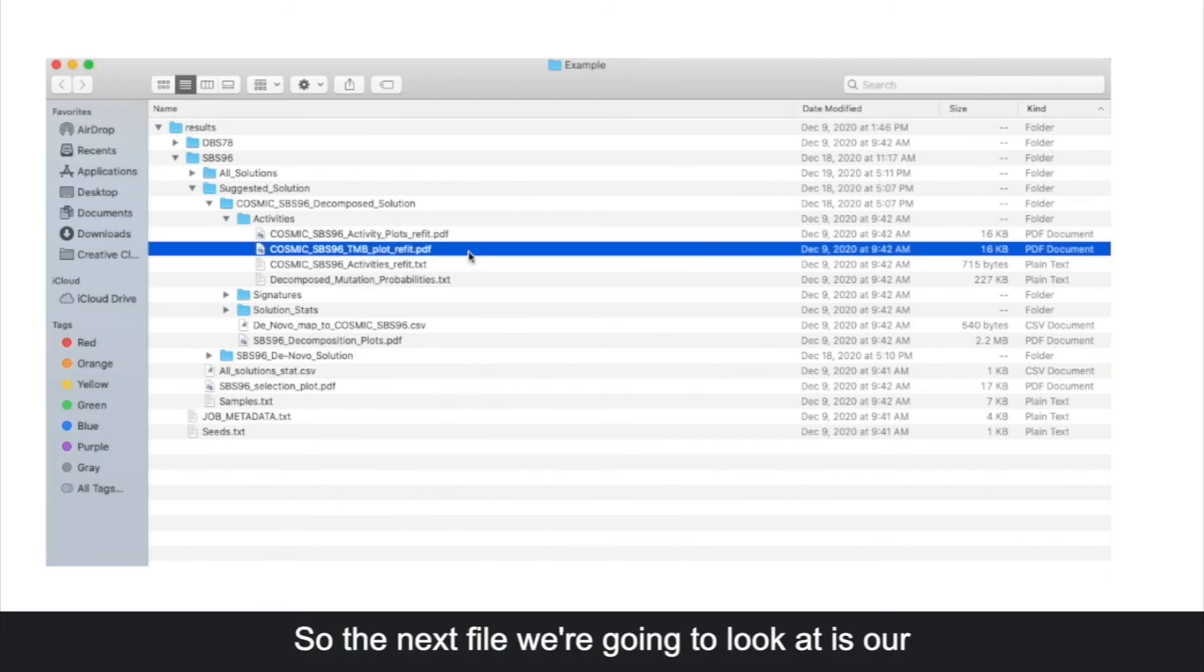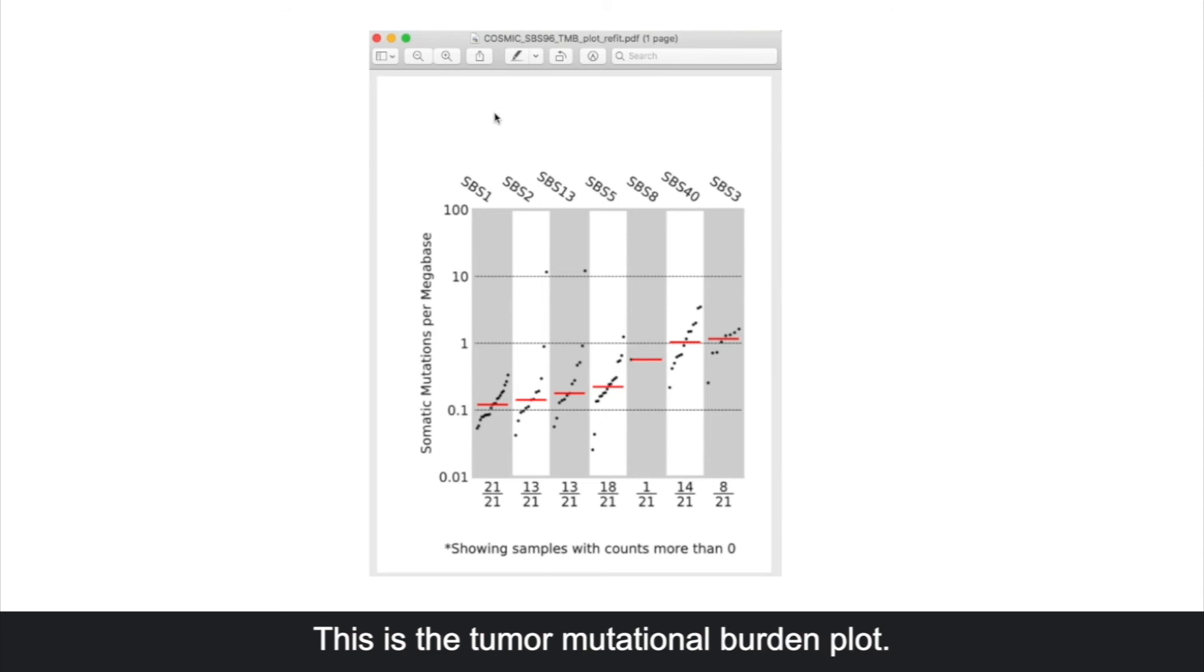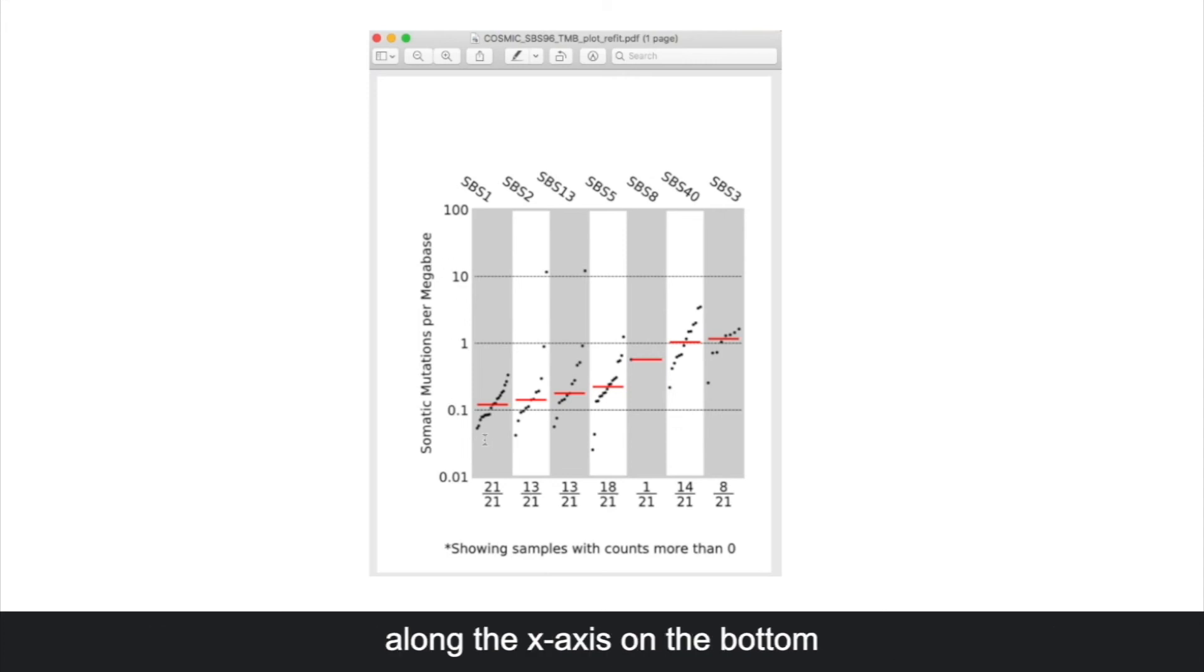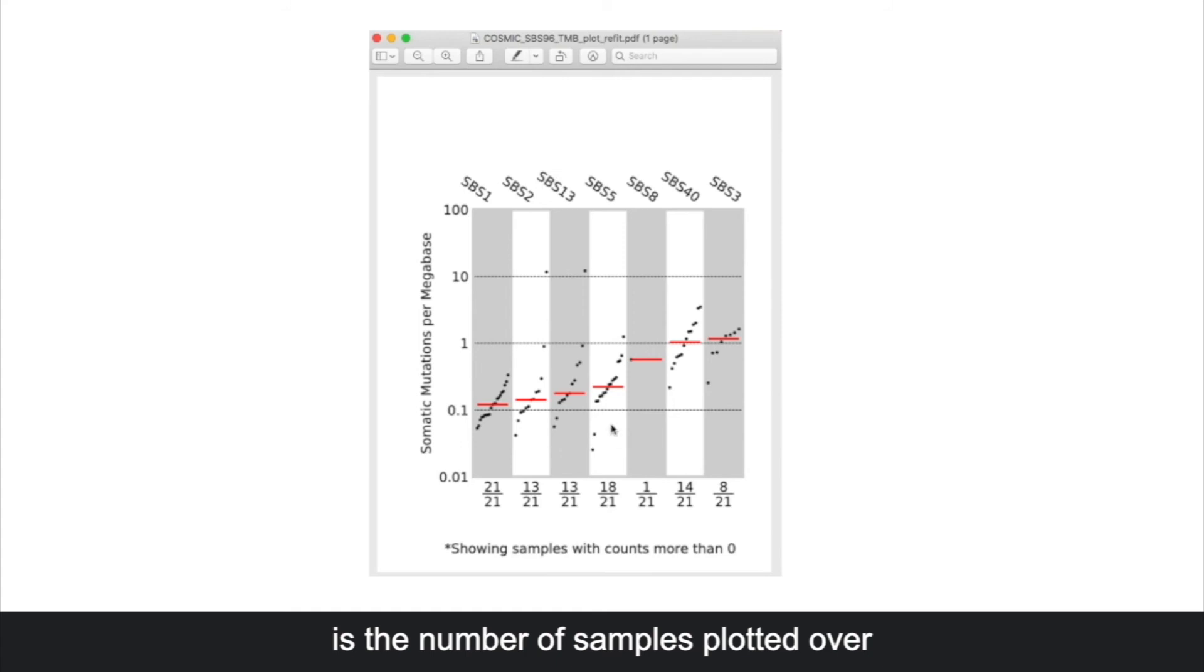Next we're going to look at our tumor mutational burden plot. This is the tumor mutational burden plot. It is ordered by the mean somatic mutations per megabase. Along the x-axis on the bottom is the number of samples plotted over the number of samples included.